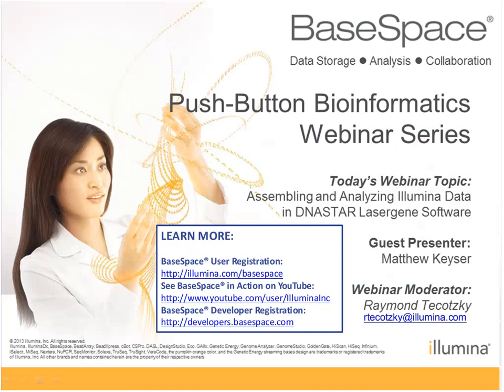So it's hands-off with the data. And then when you have a cloud app like SeqMan engine on BaseSpace, the interface is very simplified. So you can run an assembly using someone else's hardware. You don't have to set up all the RAM that you need for the de novo assembly. You can use the hardware that's up on the cloud. So you have an advantage for hardware, and then also the downloading of the project. You can do some of the analysis up on the cloud and just download a completed project to complete your analysis. So it really streamlines the whole process for customers.